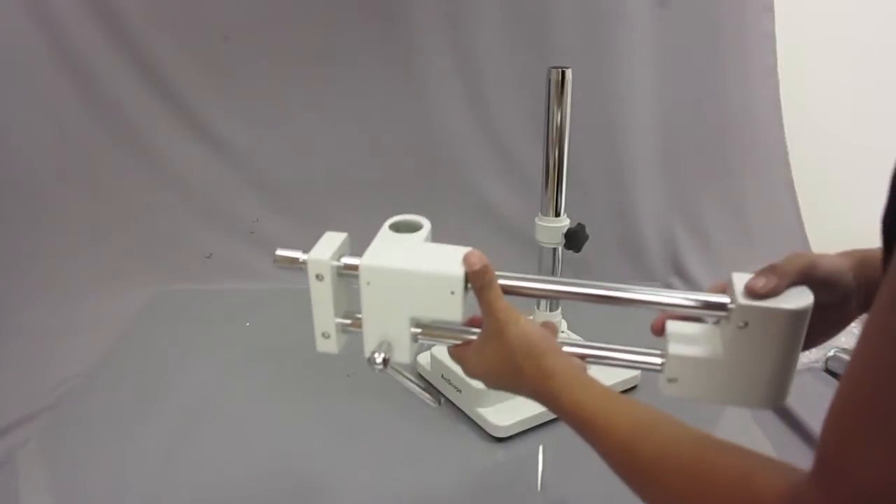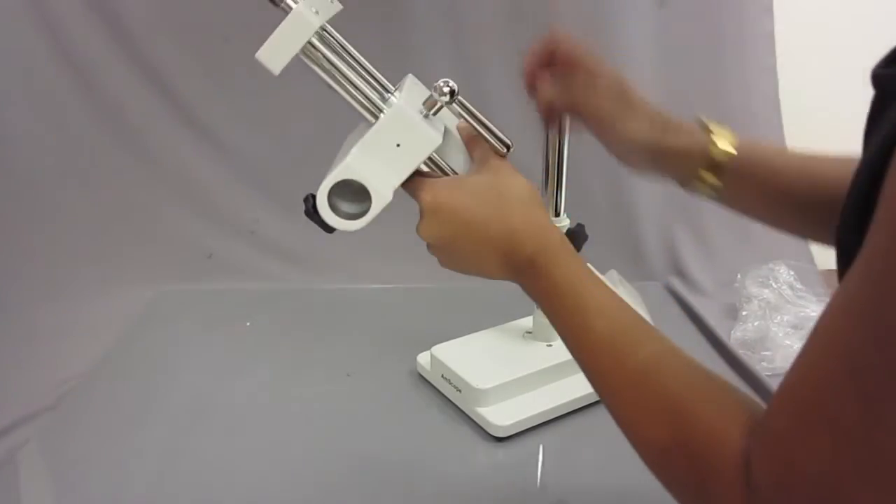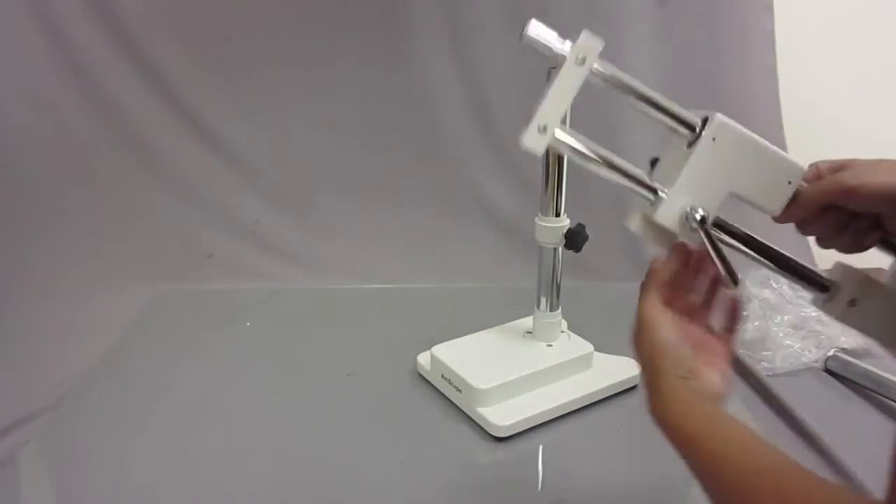The second part holds the head of the microscope, the focusing rack, and all that. It should slide pretty easily. There's a large opening here and all we're going to do is just drop it right onto the pole.